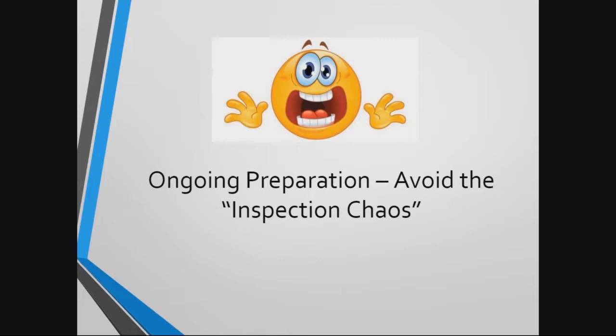So I've found over the years that it is most effective to take an ongoing CAP readiness approach to the external assessment component of the quality improvement program. By that I mean that labs should not approach inspection as a one-time annual activity. This makes for an extremely stressful time for either the interim inspection while completing that required documentation that needs to be submitted to CAP, or as the on-site inspection window draws near.